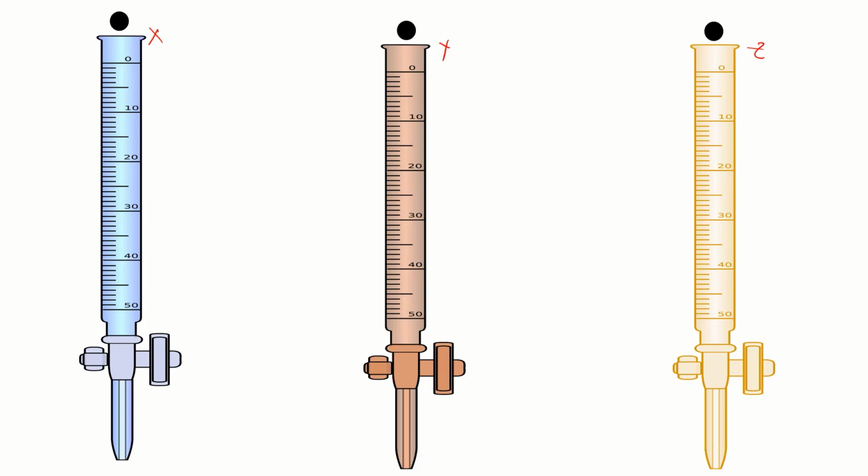Now, what is viscosity? Viscosity can simply be termed, in simple words, as how much a liquid can flow. So the resistance of a liquid to flow is what we call viscosity. Now we can easily see this in real life with pap. All of us know about pap, and let's use a normal liquid which everyone knows, water.